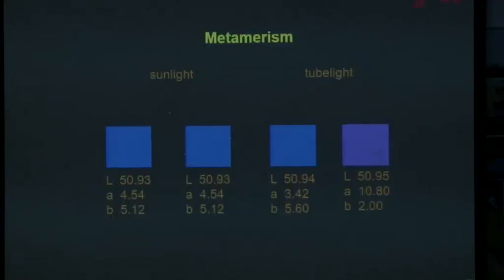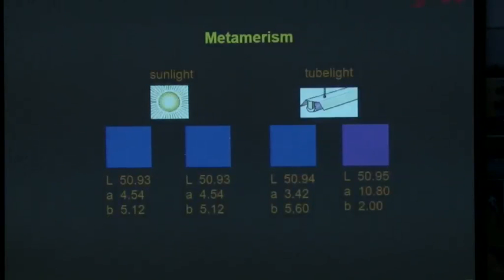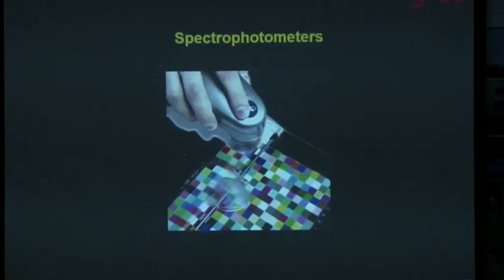If you measure only with a colorimeter, some colors will match under some light, but it will not match under other light. This we call metameric match. But if you measure the color with a spectrophotometer and if the spectrum is the same for both the colors, then under any light it will match. Okay? So you need the spectrophotometer which will measure throughout the spectrum.